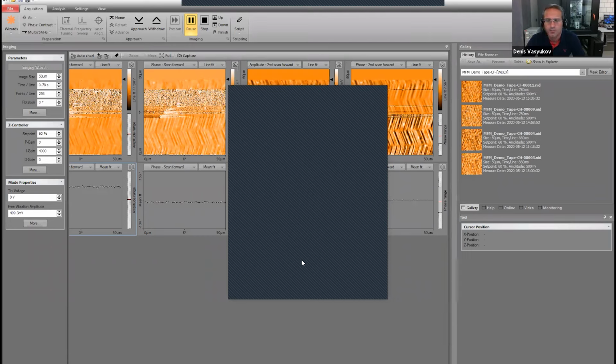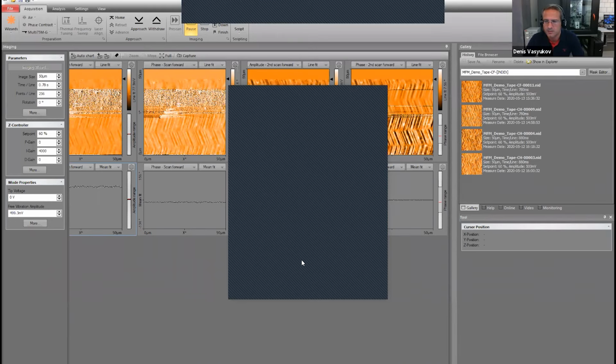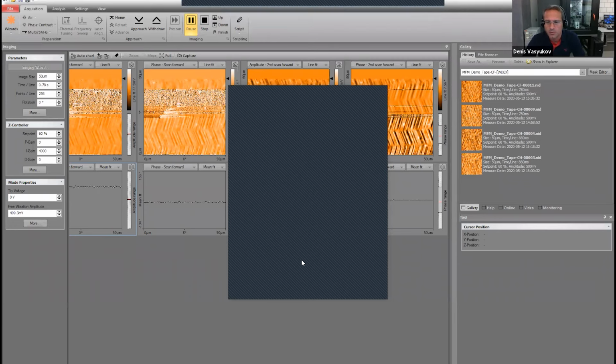But performing EFM on the MFM sample at the same time, I don't think is possible. You could do it on the same sample if you switch from a magnetic cantilever to a conducting cantilever and do EFM separately. You would have to open the system and change the cantilever, but together, EFM and MFM is not possible.